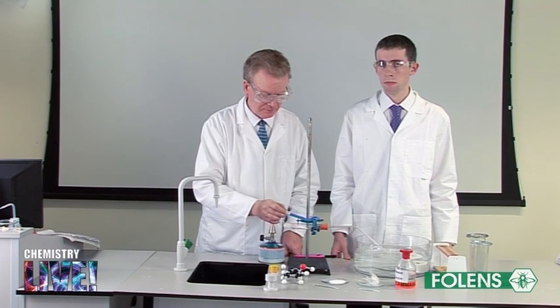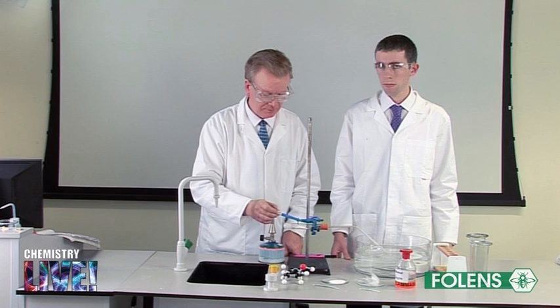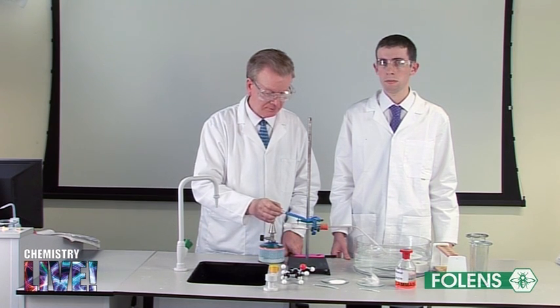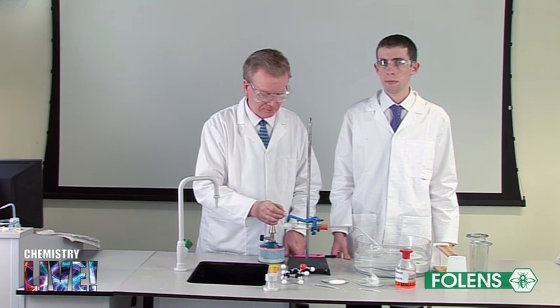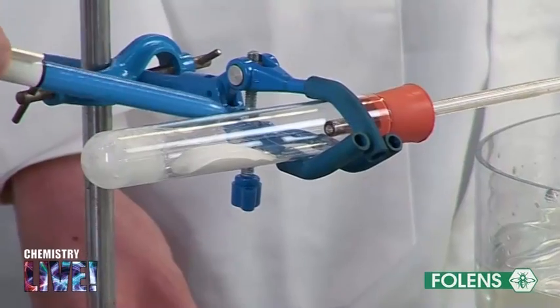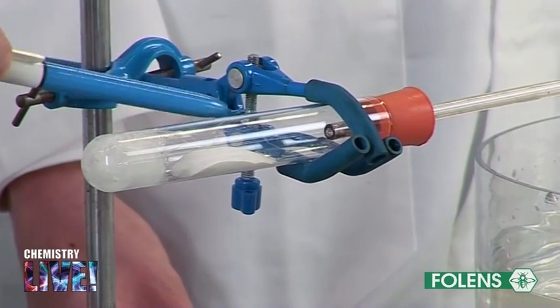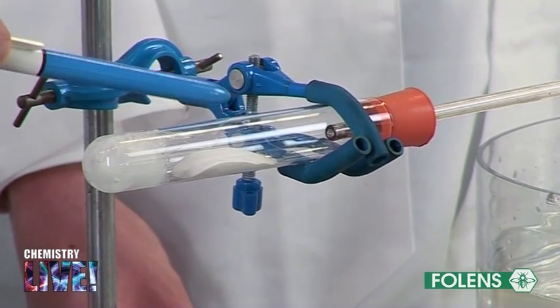Using a retort stand, the boiling tube is clamped near its mouth and in a horizontal position as shown. Using a spatula, a heap of aluminium oxide is placed about halfway along the boiling tube.